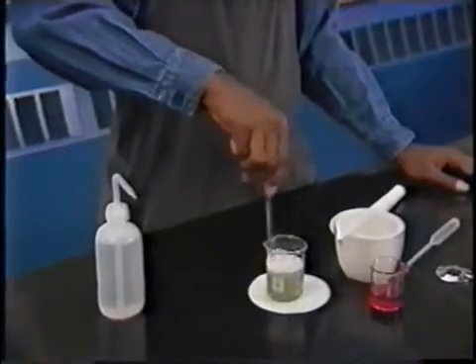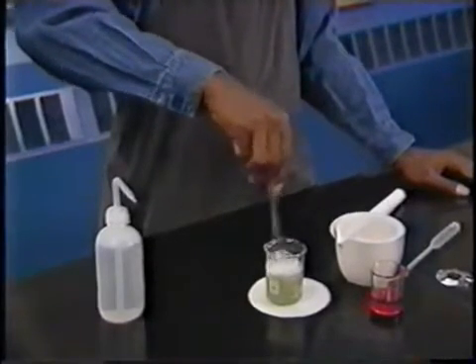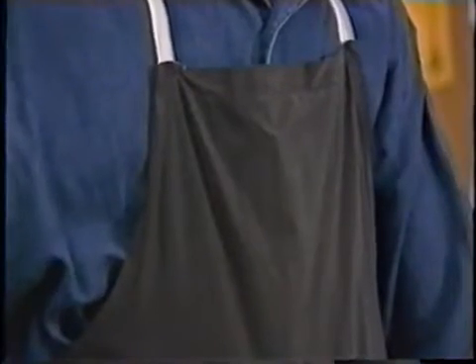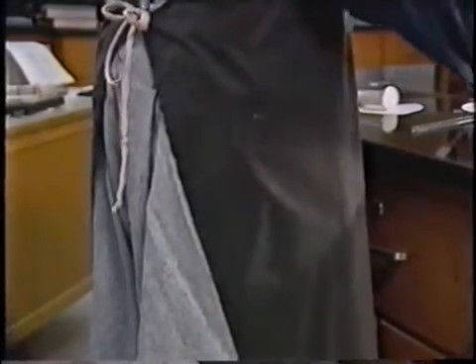The right kind of clothing includes sleeves and shirts that fit fairly close but aren't too tight to restrict movement, and fabrics made of sturdy cotton or wool that won't melt and stick to your skin. A lab apron keeps most splashes off your clothes, but you should still wear older clothes underneath in case any chemicals get past the apron.